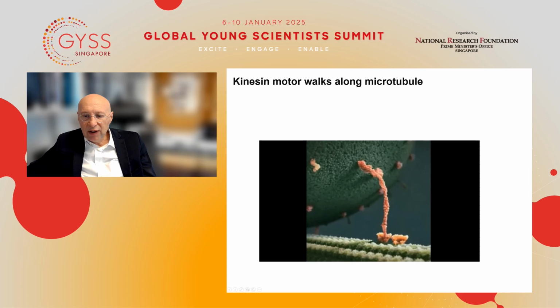This is one of the most famous scientific cartoons, the movement of kinesin on a microtubule, and kinesin carries cargo like neurotransmitters and so on. And there have been a lot of pioneering studies, very good studies, of course, showing that the molecule works in this hand-over-hand scheme. They were all done with a camera, so with the old way of localizing molecules. That's why the methods were relatively slow.